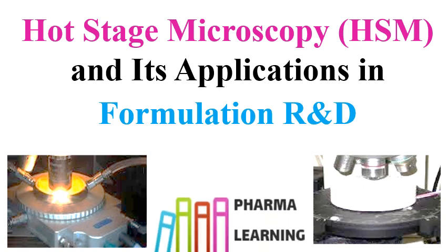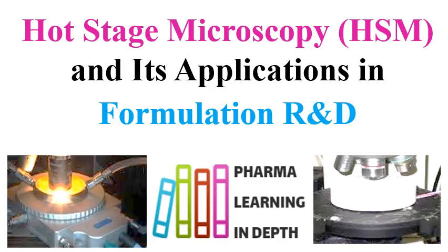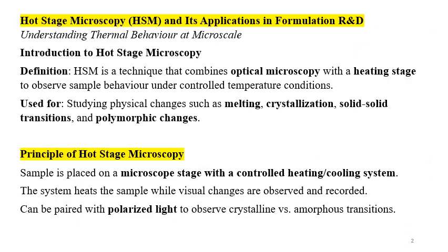In pharmaceutical analysis, many analytical techniques are used. Each analytical technique has a specific use and application. Out of those analytical techniques, hot stage microscopy (HSM) is used in the pharmaceutical industry, and it has wide application in formulation R&D as well as in API analysis.